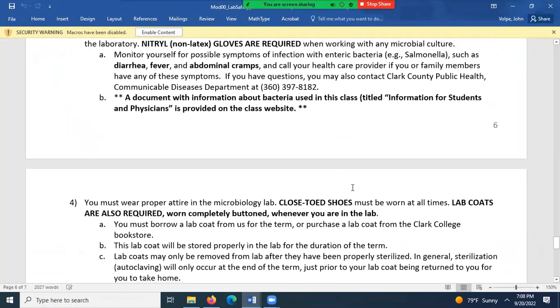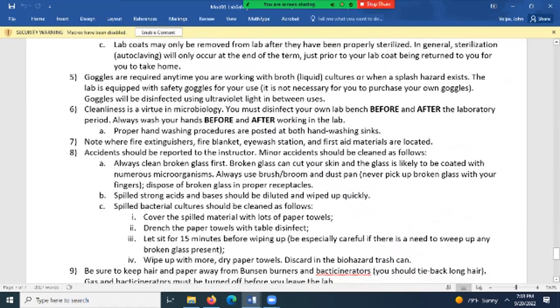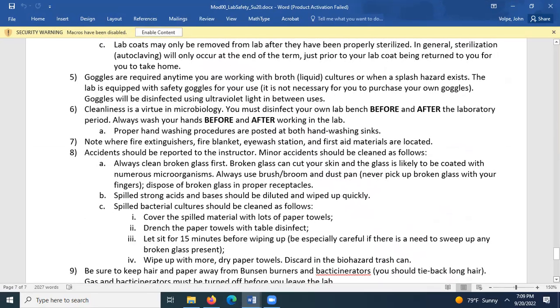And we do have a document for safety information for students who get sick when handling microbiology materials. It's not totally applicable to you guys because you're not going to handle actual bacteria. It probably tells you that in the past somebody who was a microbiology student once got sick, and the material was a bacteria they took home with them from the lab. And that's why we follow these safety rules.